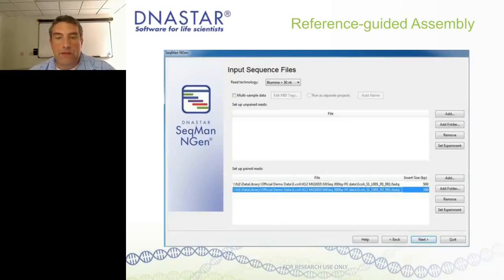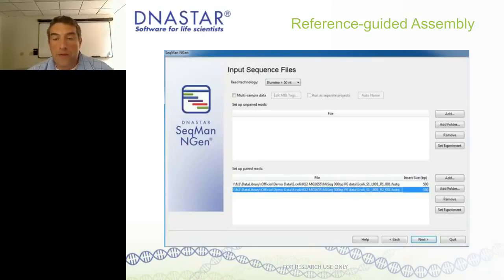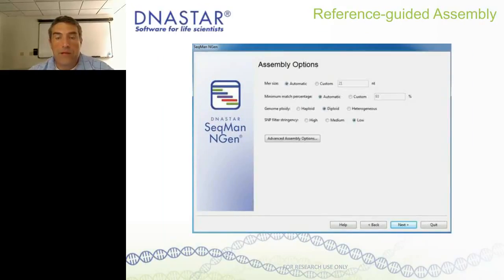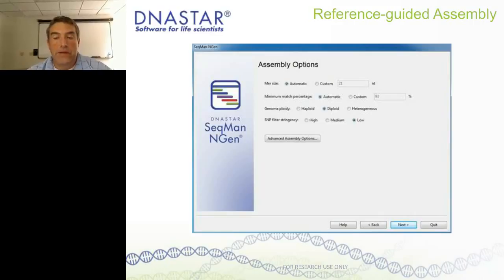Once we've picked the reference genome, we select the read technology. In this case I have Illumina data and I've loaded in paired data. It will prompt you for a pair distance — the distance between the forward and reverse pairs. I've loaded in two FASTQ files here as paired-end data, about 500 base pairs apart. You could have mate pair data that could be 5,000 base pairs apart. The algorithm uses that information to help with structural variant analysis and, in a de novo assembly, to create genomic scaffolds. With Illumina data, we generally stick with defaults, though I would change genome ploidy to haploid, which affects the SNP calling.